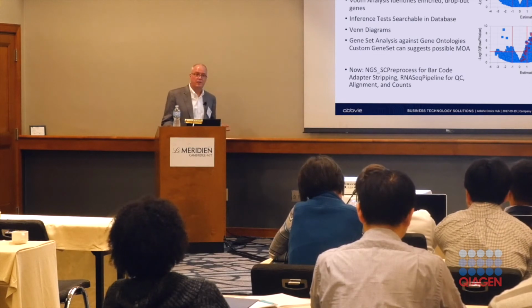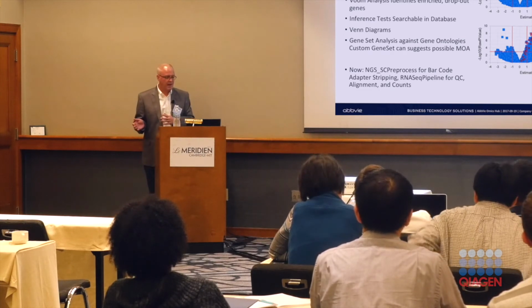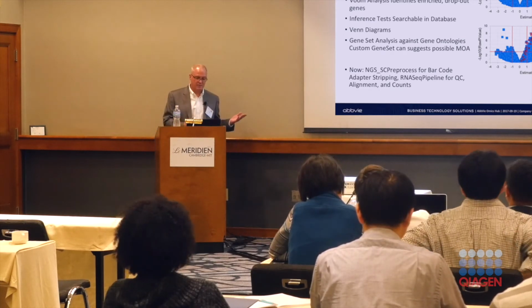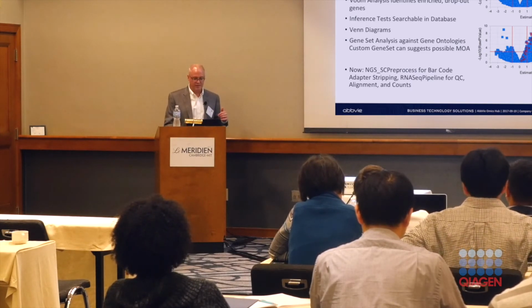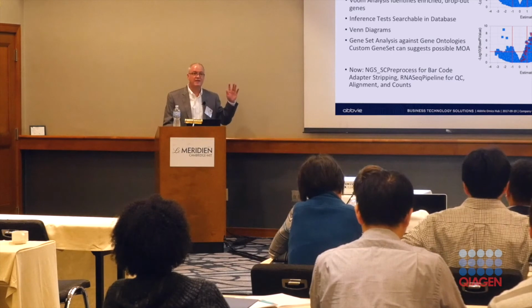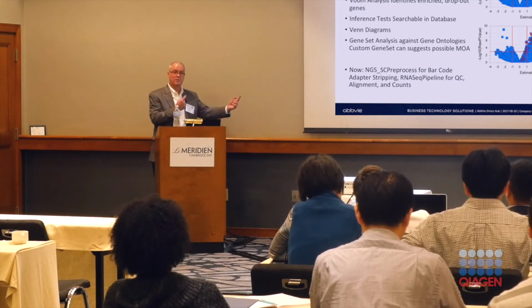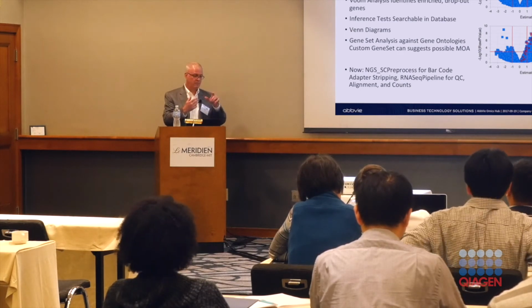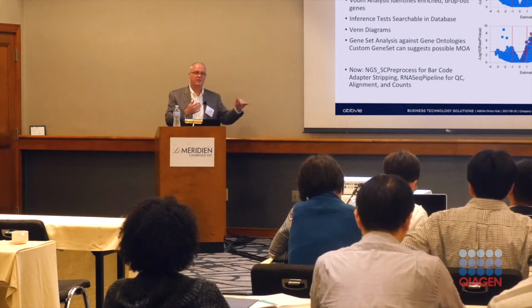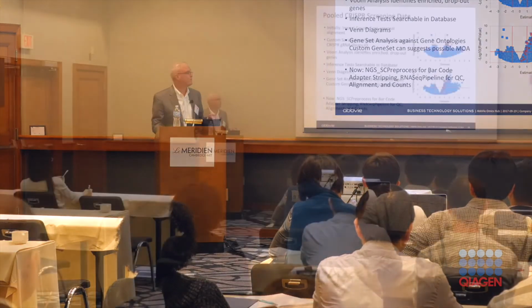CRISPR data, we've started that. Initially, we were just taking the counts from some external alignment and made a custom server annotation so that we could just bring in the CRISPR Library ID as the annotation, and then know what the gene was and where it was on the chromosome, because many times you'll get a knockdown from only a few of the reagents for that gene, not everywhere across the gene for whatever reason.